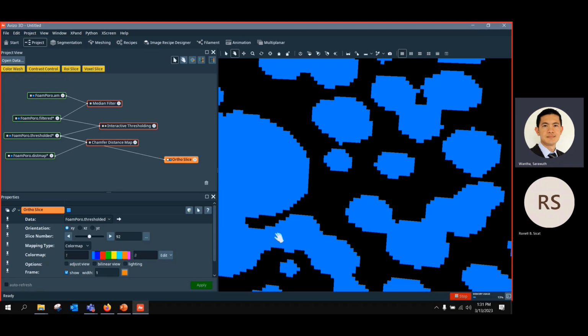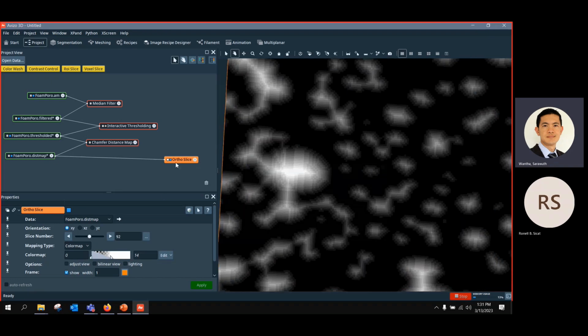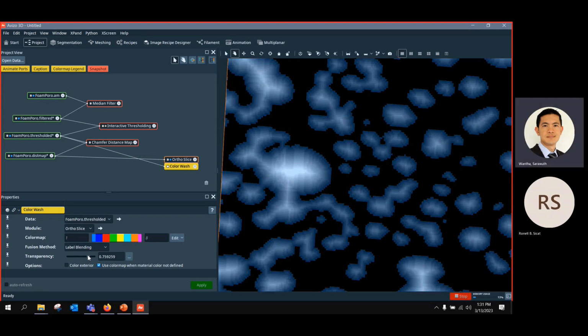The intensity increases until they reach the innermost of the image like this. If I overlay them quickly, you can imagine it like this.